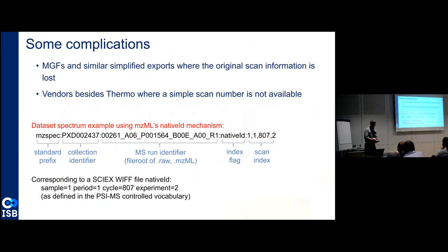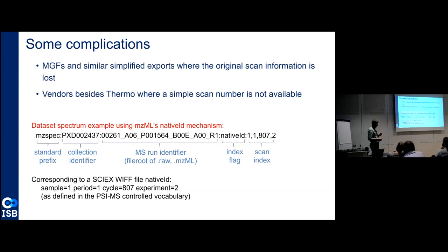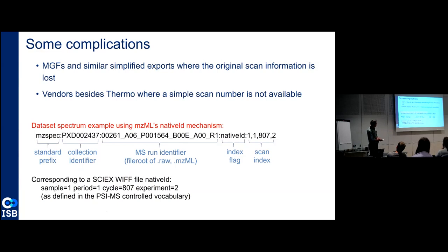There are some complications. One complication is MGF files — a lot of people convert their MZMLs or raw files to MGF files, and often the original scan information is lost during that conversion. It doesn't have to be — there is an MGF keyword called 'scans' that can preserve this information if a good converter keeps it. Some converters actually put the scan number in the title string. But it seems like often during conversion it's lost, and I think that's the biggest problem we're facing. We always want to be able to link any spectrum back to the original data.